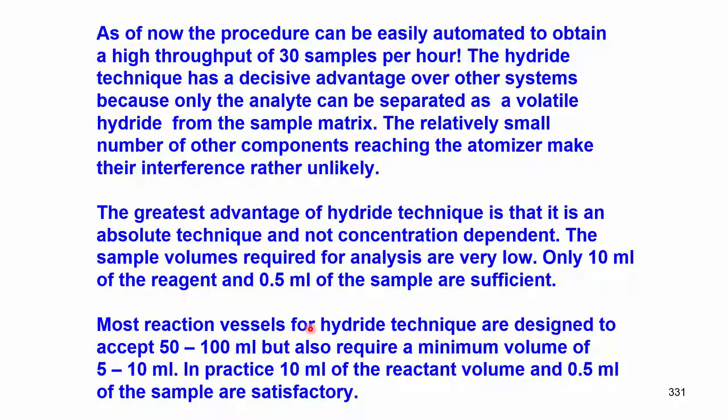AAS being element specific, even if other hydride forming elements are there, the analysis will take place only for the element for which the hollow cathode lamp has been put. So, only the analyte element can be separated as a volatile hydride from the sample matrix.